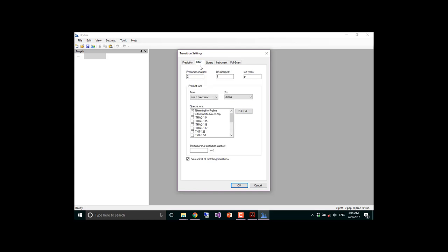And the filter tab, I'm going to turn off this N-terminal proline, and I'm going to go from ion 3 to last. Oh well, yeah. We'll do last ion. We'll see that this data was run with last ion minus 1, I think, which again was the mistake we made in communicating between software development and use.